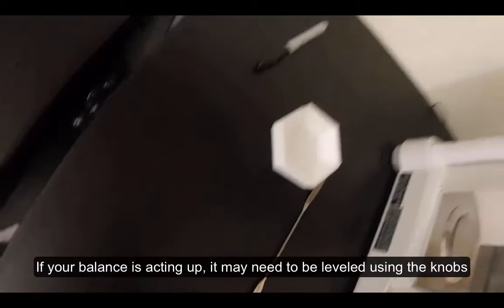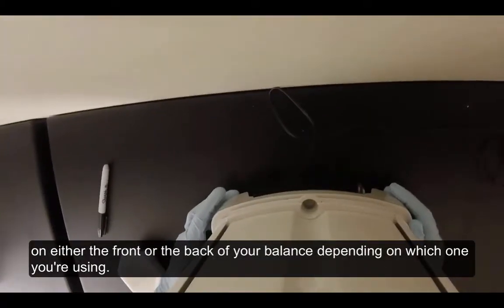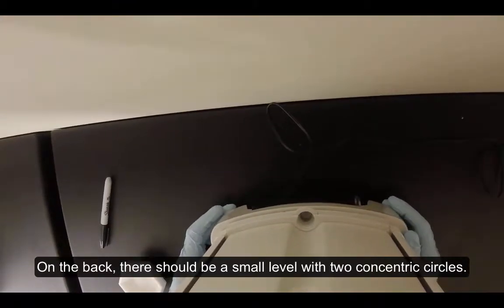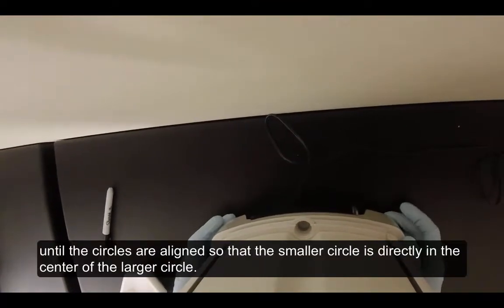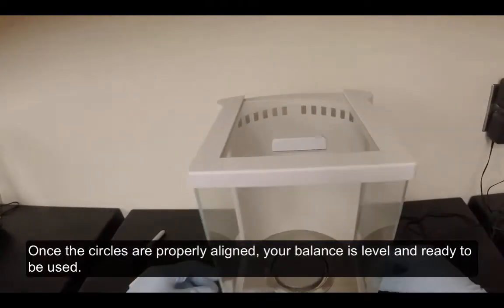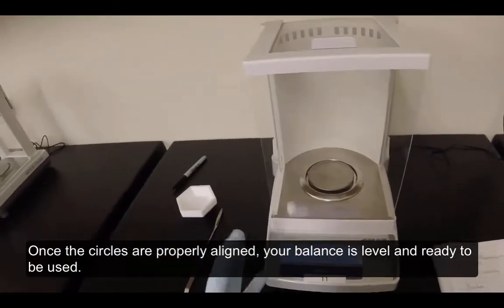If your balance is acting up, it may need to be leveled using the knobs on either the front or the back of your balance, depending on which one you're using. On the back, there should be a small level with two concentric circles. Adjust the knobs on the bottom of the balance until the circles are aligned so that the smaller circle is directly in the center of the larger circle. Once the circles are properly aligned, your balance is level and ready to be used.